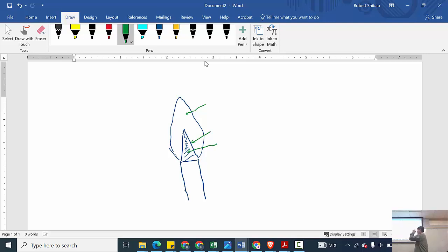So what's happening is, where the combustion is taking place, where we have that right ratio of air to fuel, is not inside the cone. Inside the cone, is there any combustion taking place based on your observations? No. Right at the surface of the cone is where we get that max reaction. And so the surface of the cone is going to be the hottest. In fact, like the tip of the cone, people say, is the hottest. And so anywhere on the surface or the tip, here. And so if you're going to pick one spot, I'd just pick the tip of the cone as being the hottest.